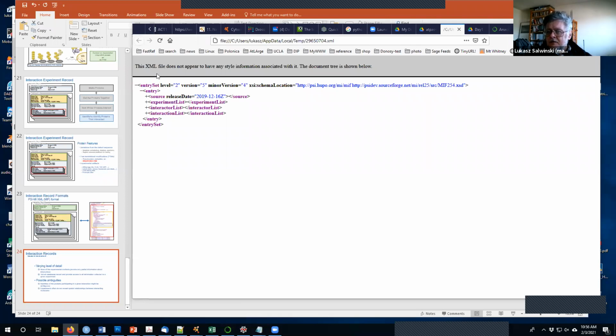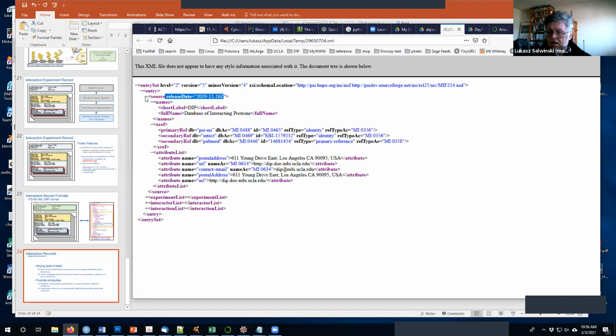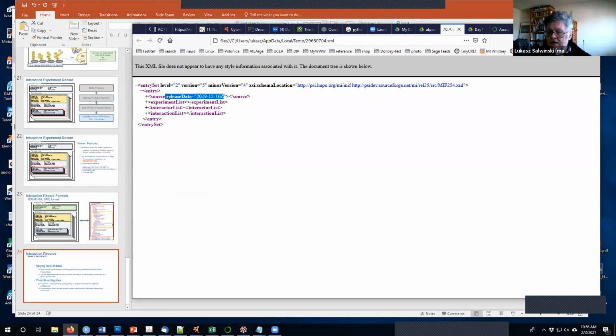By XML, what it means is it's essentially a format where you've got pairs of tags, one with the name, the other one with the name preceded with a slash, that themselves might contain more elements that look like that. Some of them might have attributes attached to them in the name, and inside there's more and more stuff. It's like a Russian doll.